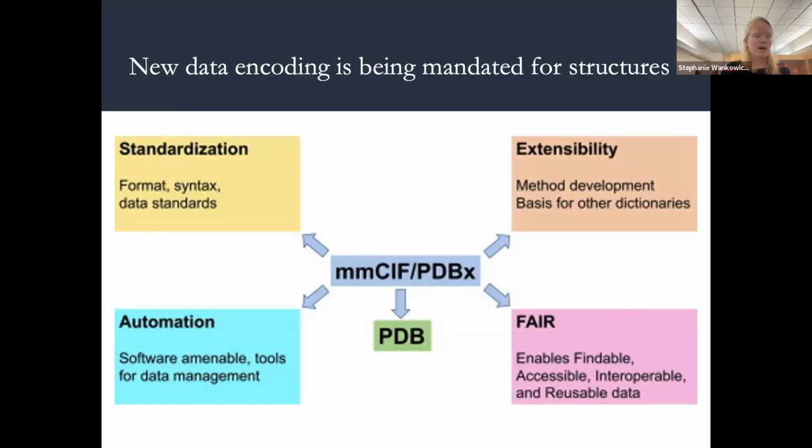And so the proposal that I have, that we're trying to argue about with the PDB right now, is that the mmCIF needs some amending to be able to capture the link between the conformational heterogeneity that exists in our experimental data and that's not captured in the models. So currently, the way that mmCIF is capturing the conformational heterogeneity is in the exact same way as in the historical PDB, with this alt-loc.